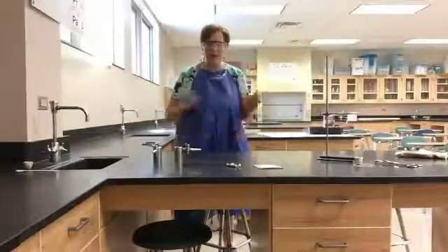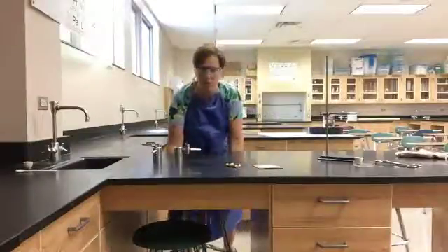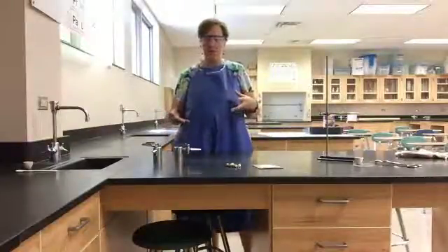Whenever we do a lab that involves fire or anything particularly dangerous, we always want to put the stools in and do a stand-up lab. So if something happens — fire or a chemical spill — it doesn't fall into our lap.